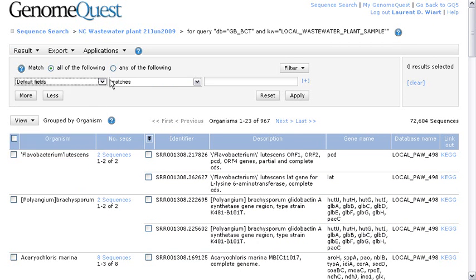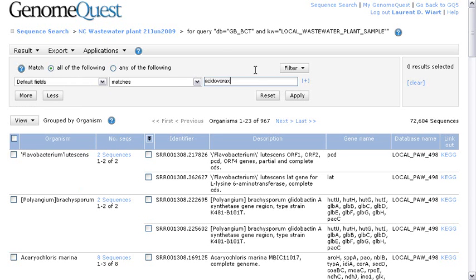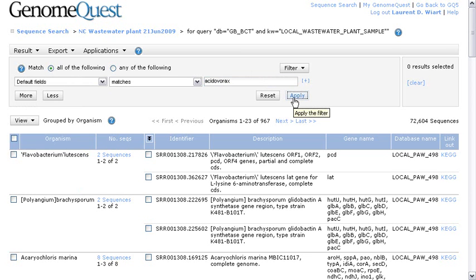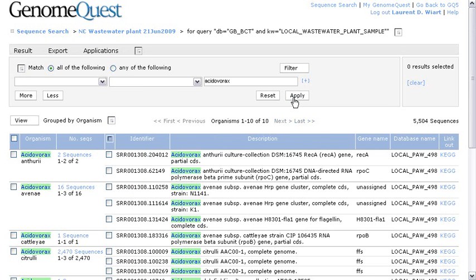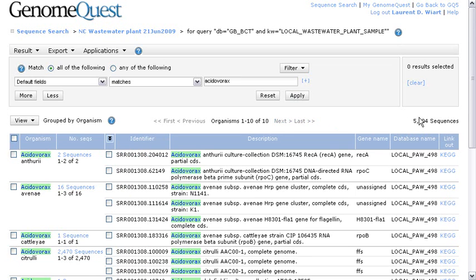And here, now, if I want to refine the search and select on some specific organism, I could say now I want to see anything where acidovorax is mentioned, mainly in the organism field. Now, I apply the filter.